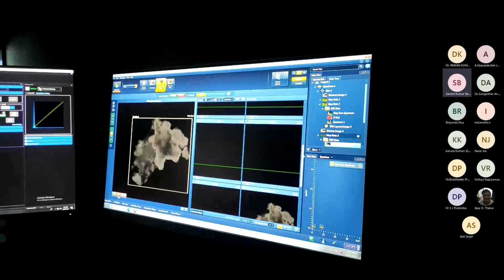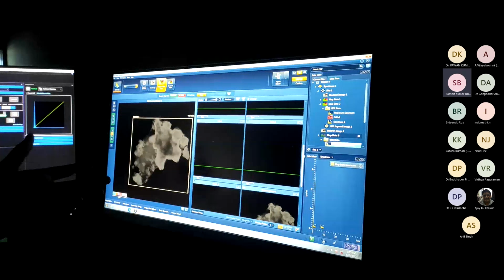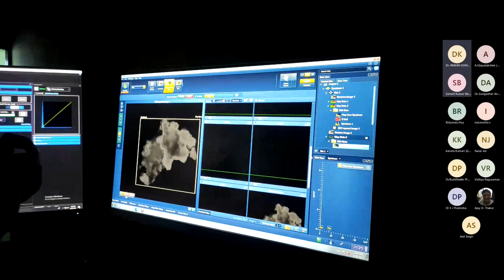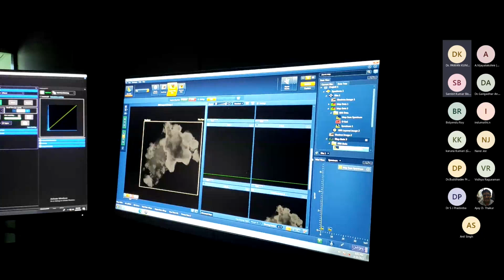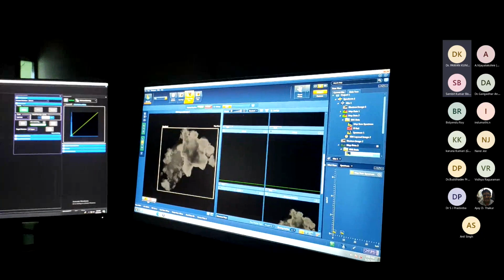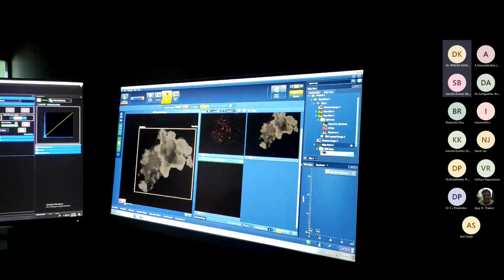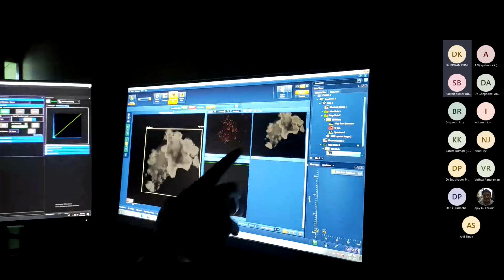We are not sure whether they are present or not, so we can exclude those elements and include only the elements of our interest. Since we already prepared the sample and have an idea which elements are present, we'll keep only those elements, and we can see how they are distributed.